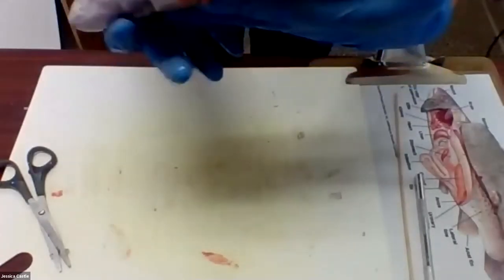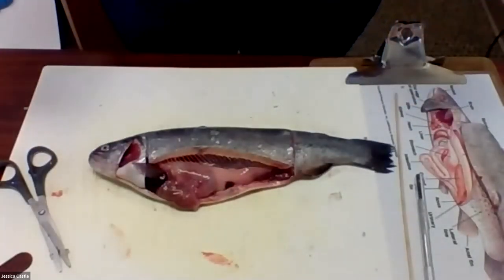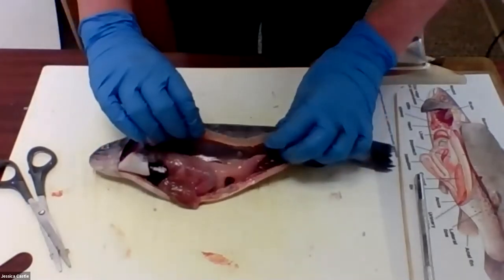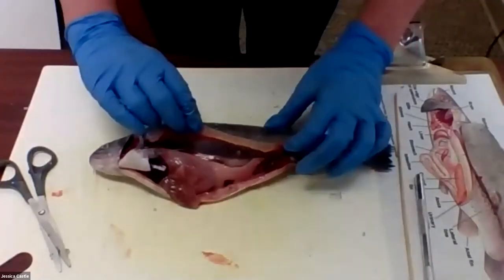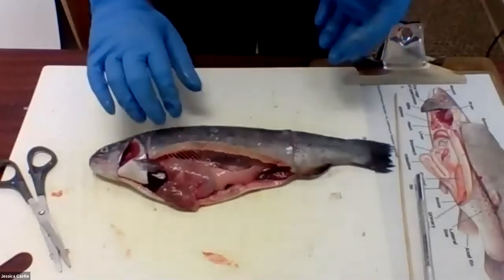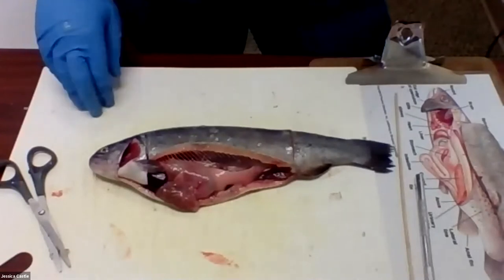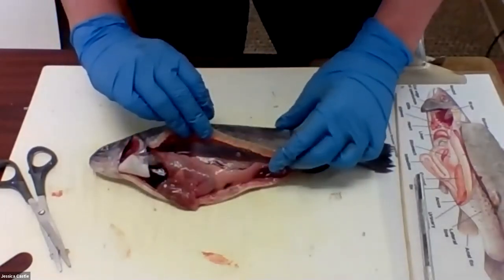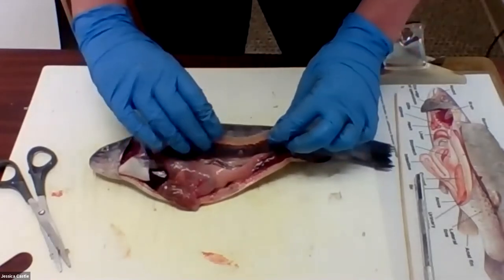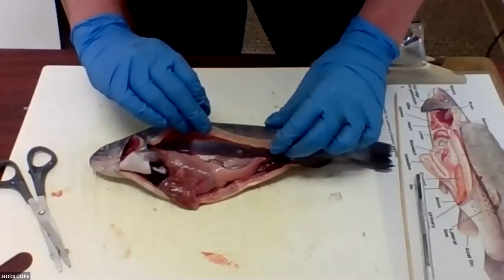The swim bladder is basically what helps the fish float without a lot of energy. If you were in the water, you'd have to kick or move your arms a lot to float. A trout doesn't have to do that because they have this air bladder — also called a swim bladder — that they can fill up with air, allowing them to float. They can put more air or less air in it depending on where they want to be in the water: letting air out to sink down deeper, or adding more to rise closer to the surface.